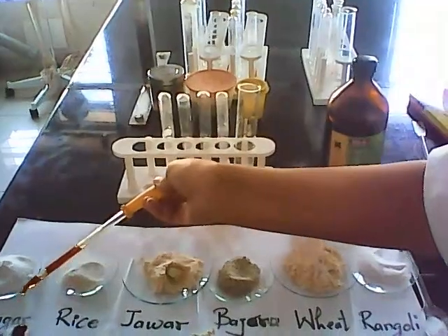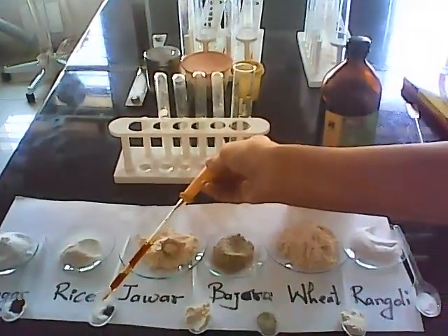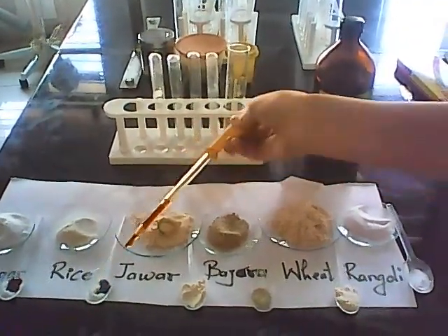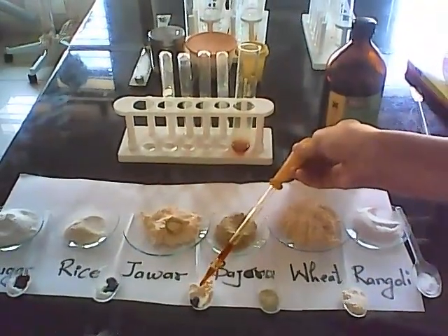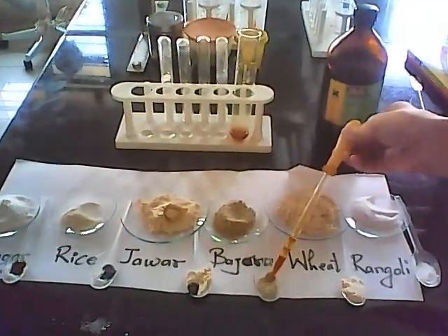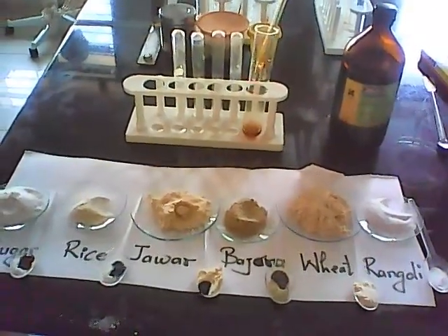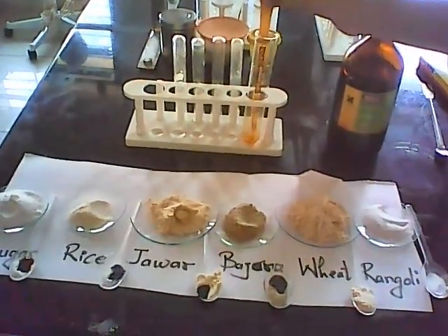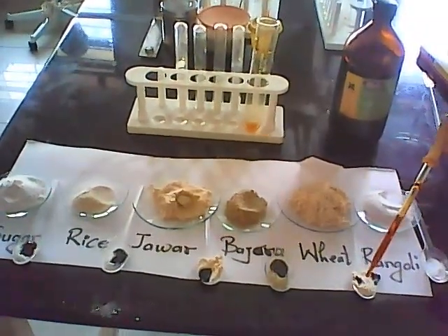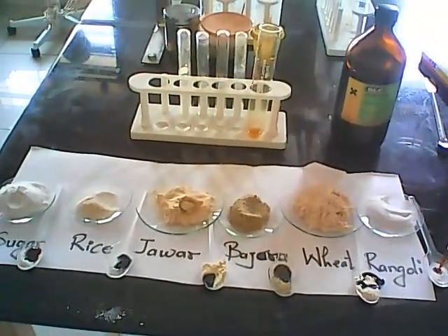Now we will put the same iodine solution in rice, then in jawar, then in bajra, in wheat, and then subsequently in rangoli. Now in rangoli.